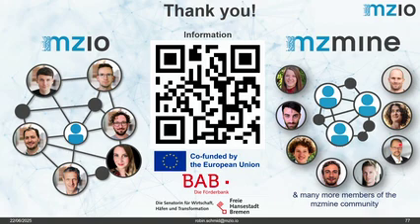Also, machine learning models are very much dependent on that, and many of them already use the library, so maybe you're already using it without even knowing. But in mzmine, just download the library, check it out, and it is open, and you can also add to it. So if you have compounds, and the capacity to run standards and acquire data, just reach out to Corinna, and she's able to help you get started.